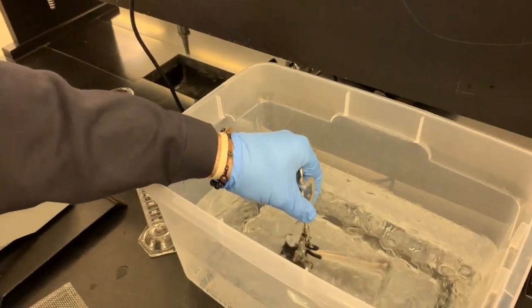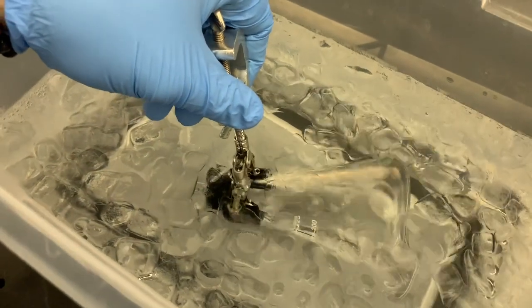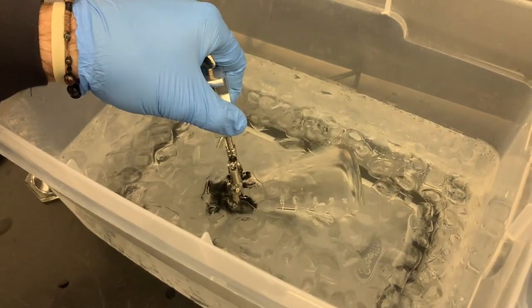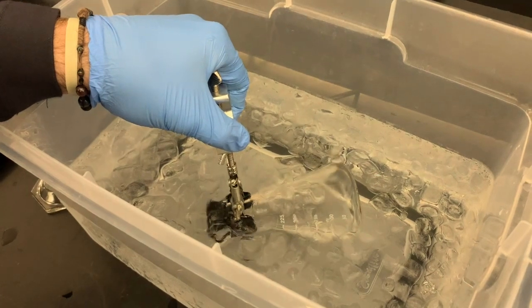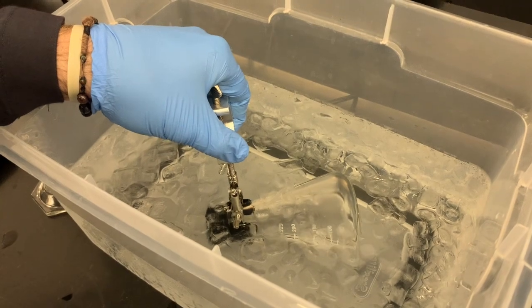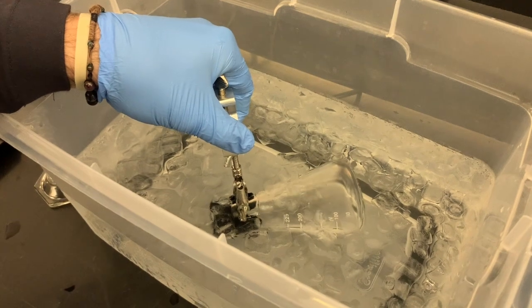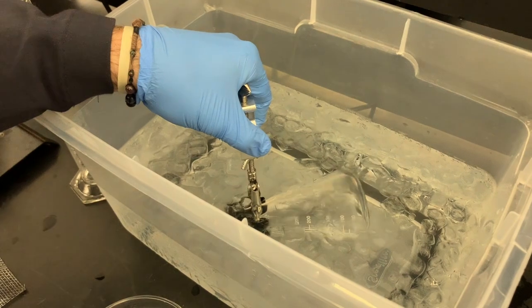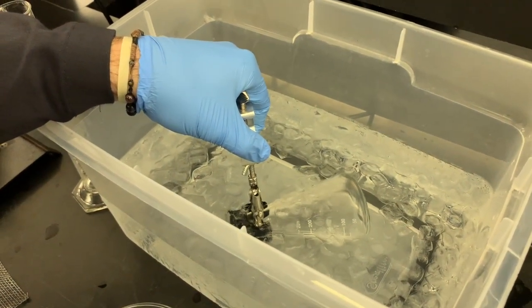Pretty immediately, you're going to see the water sort of pour in, and you're looking to make sure that bubbles are not forming at the tip of your pipette or around the edges of your flask's stopper, mostly because all the water should only be going in there, not because it's giving up air to the atmosphere above, but because of the pressure that's being formed inside pulling that liquid in. That is very important, and you'll get really inaccurate readings if you have bubbles and you lose any kind of air pressure that way.